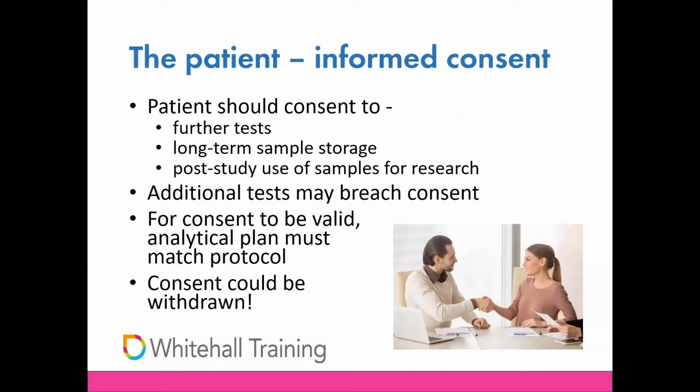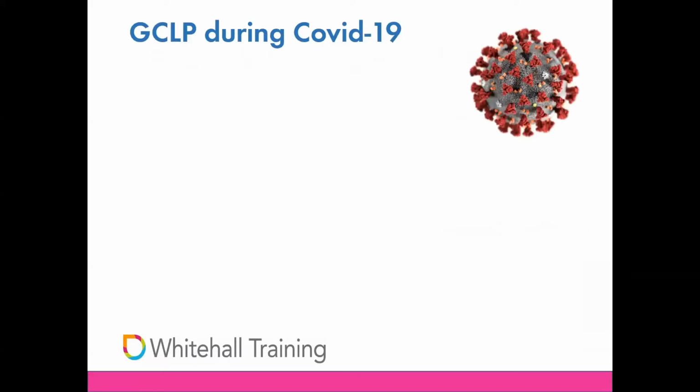Okay, so this is the end of the main part of the webinar. What I'm going to touch on briefly now is how GCLP has been impacted by COVID-19. So the MHRA, for example, has largely replaced its on-site face-to-face monitoring inspections with remote inspections.